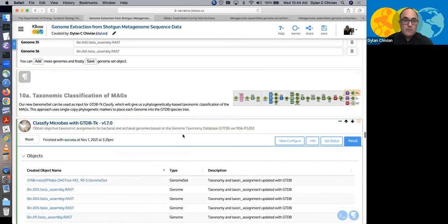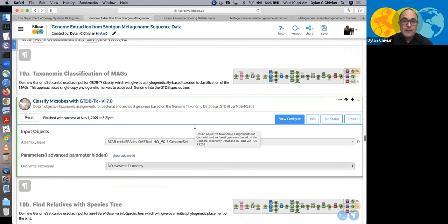So now we're going to try and get a better handle on what the lineages are for these MAGs. Now that we've pulled them out of the bin contigs, and we decided that these are the high quality ones, we're going to go forward with analyzing them like they were isolate genomes. We're going to start calling them MAGs now, because they have gene calls. They really do look like, and can be operated on like, regular isolate genomes.